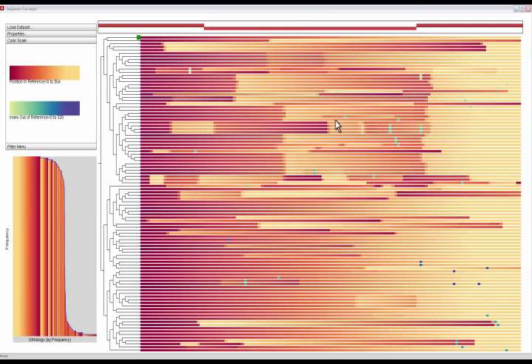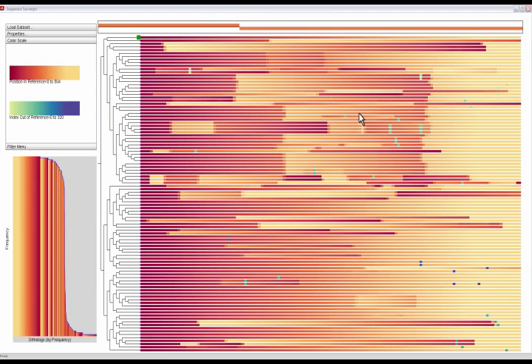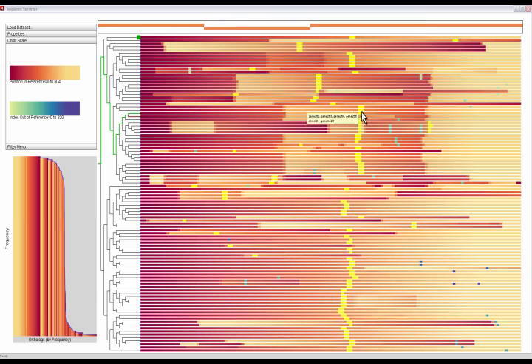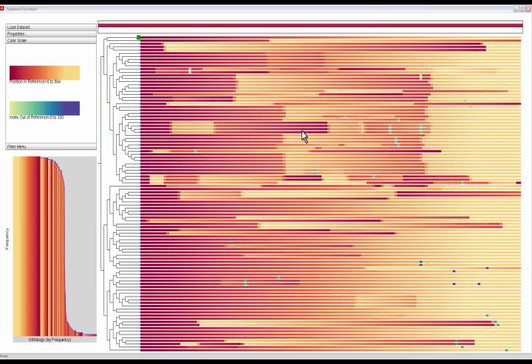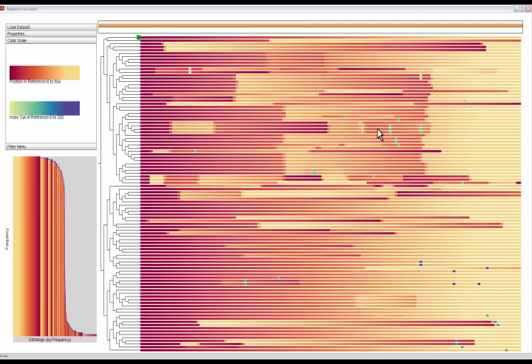In this video, we introduce Sequence Surveyor, a scalable whole genome alignment overview visualization tool capable of supporting the analysis of over 100 genomes simultaneously.